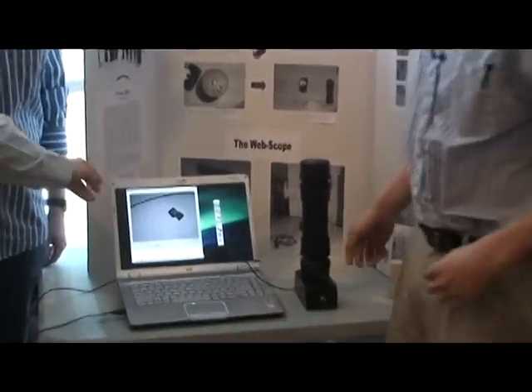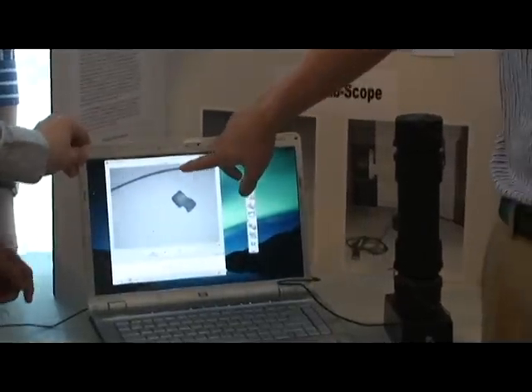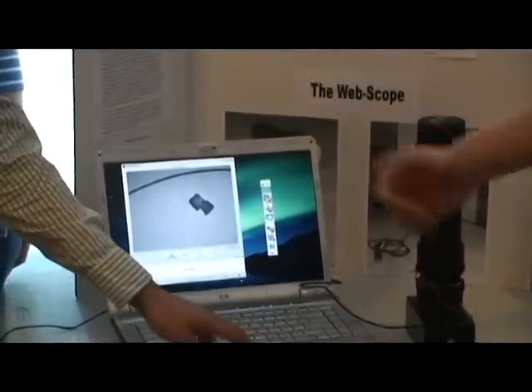Here we have a sample of table salt and human hair, magnified a significant amount.